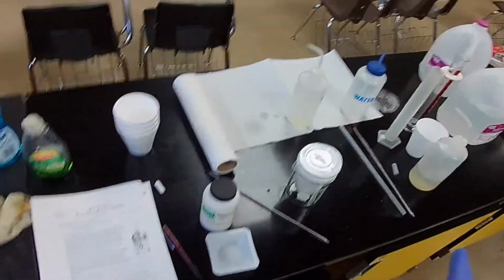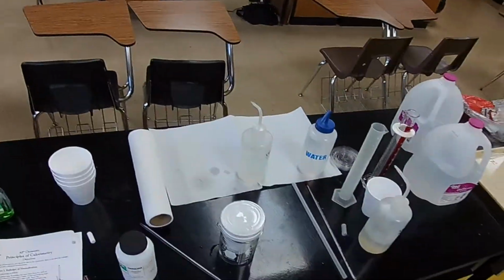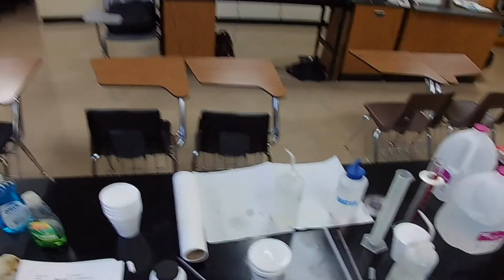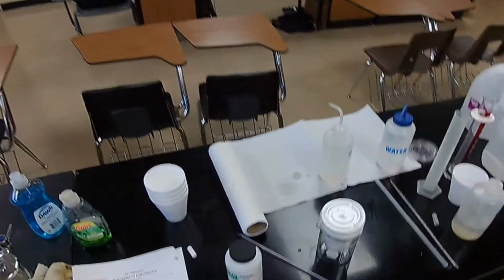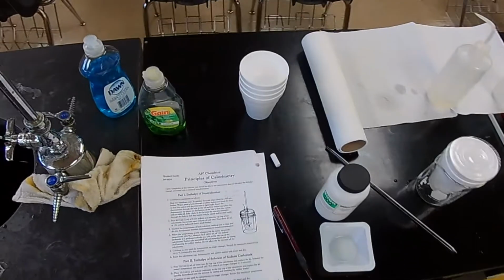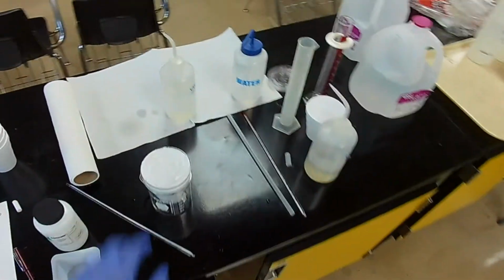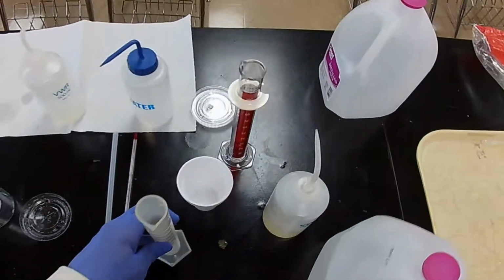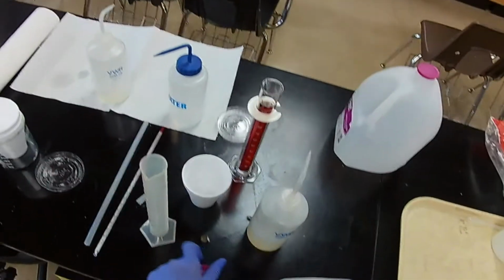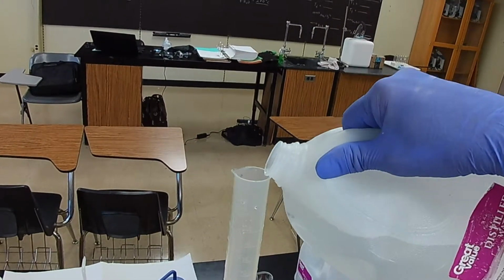So how are we going to do this? Well, we need an initial volume, or mass actually, of water and a mass of our sodium carbonate. And the method calls for 75 milliliters of water. So we'll take room temperature water, 75 milliliters, and put it in the calorimeter, and that will be our solvent.